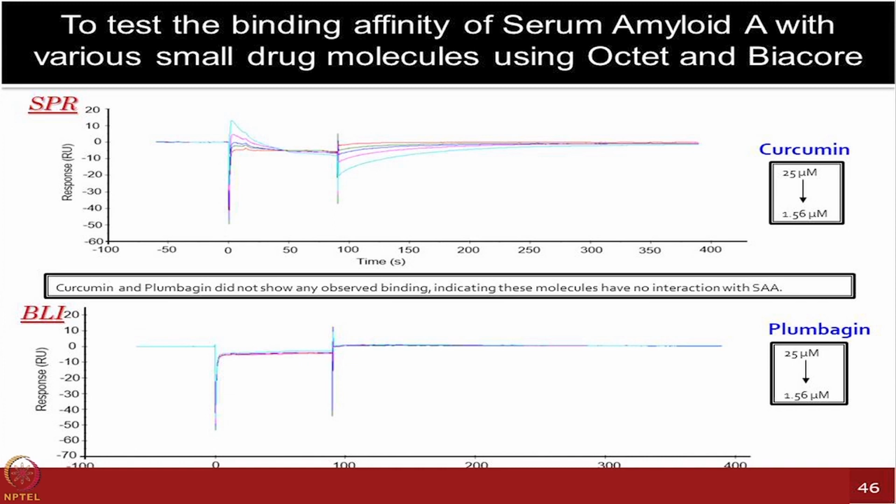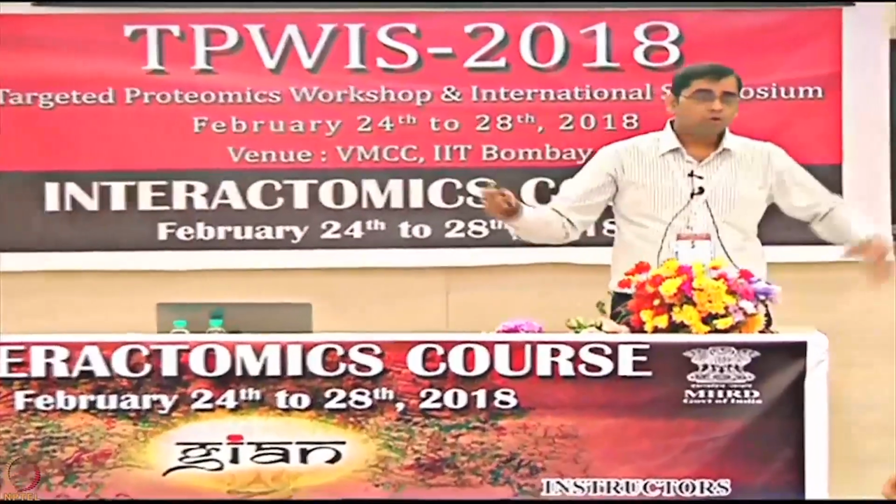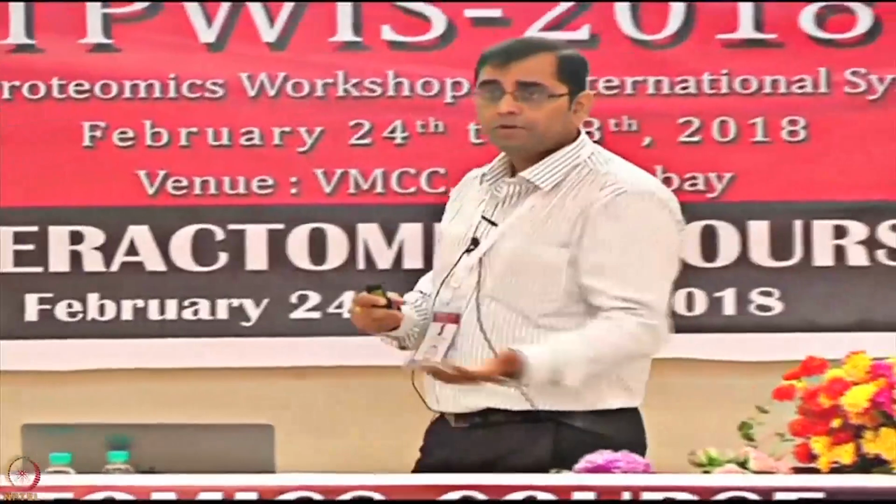So what I want to convey is that many times, don't just rush for one technology platform. Think about, if you have to test many compounds, what the cost can be and what the variations of doing those experiments can be. Start using those platforms which can narrow down your leads and hits. Then do the final experiments on something which is really acceptable.